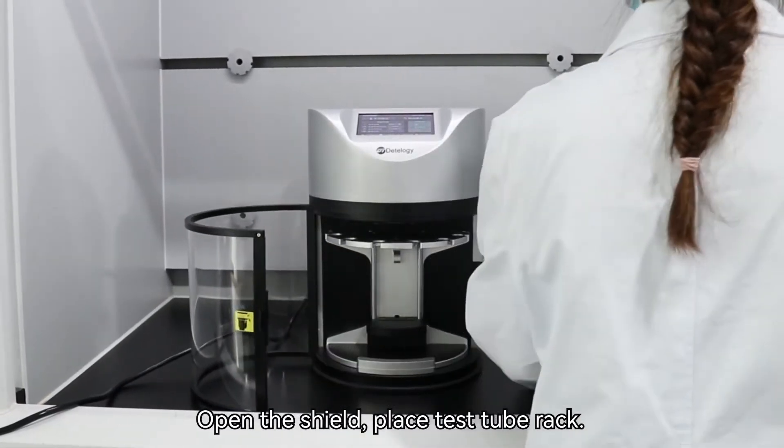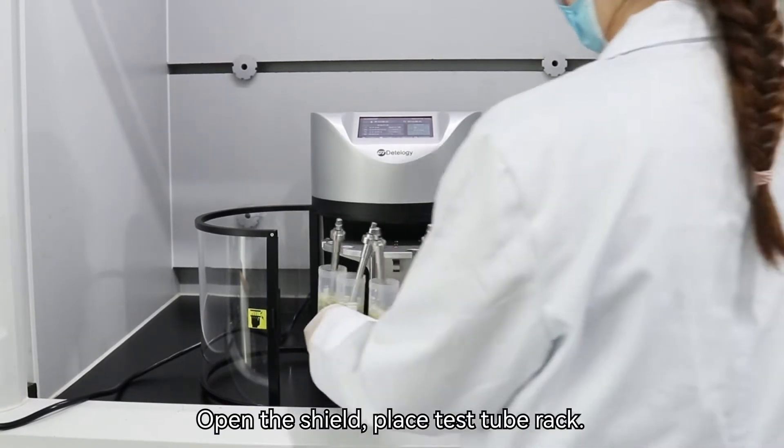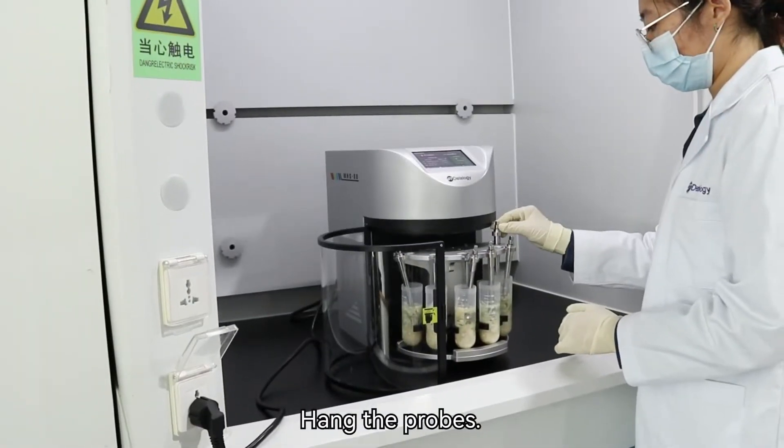Open the shield and place the test tube rack. Hang the probes.